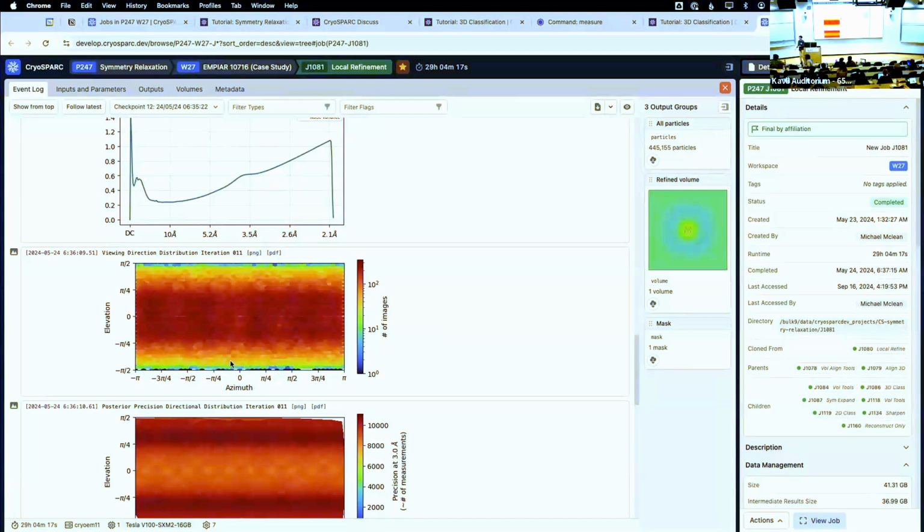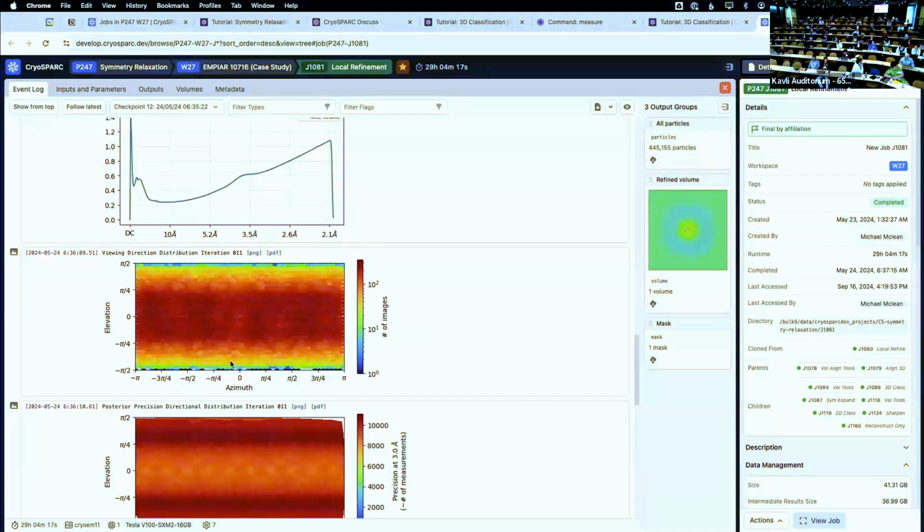It's a very interesting assembly question for these particles. On the icosahedral particle, I expect that will be correct because you get 2.8 angstrom, so they can build a model. Do they know what kinds of molecules make up the tetrahedral particle inside?